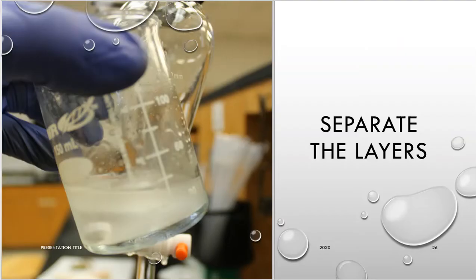After all of that was transferred, here's a picture of the beaker, and you can clearly see two layers of liquid in the beaker. I'm seeing one layer up here at the top, and then another layer with our magnet down here in the bottom, and we need to separate those two layers from each other.